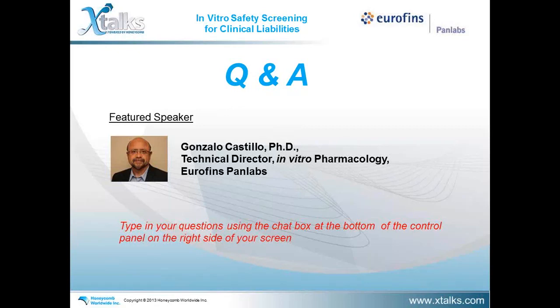Right. Okay. Thank you. Our next question: what's the typical turnaround time after receipt of a compound on your end? 10 days. So normally, actually, for this particular target panel, SafetyScreen, the turnaround time is 10 days, 2 weeks.